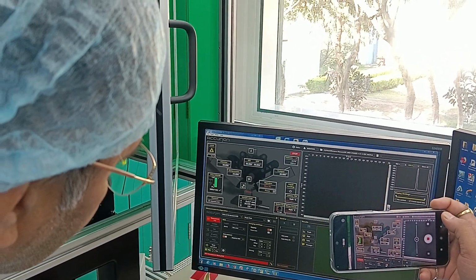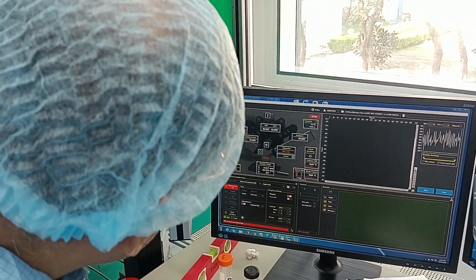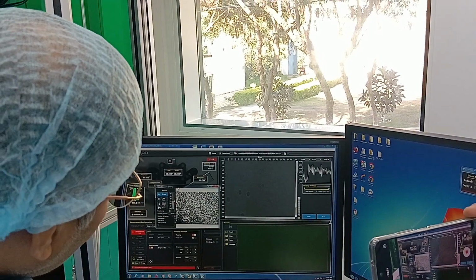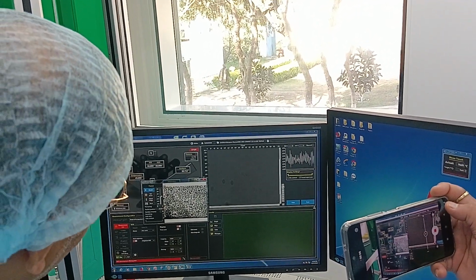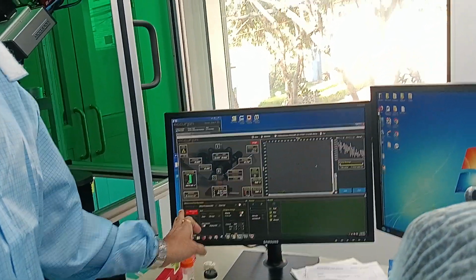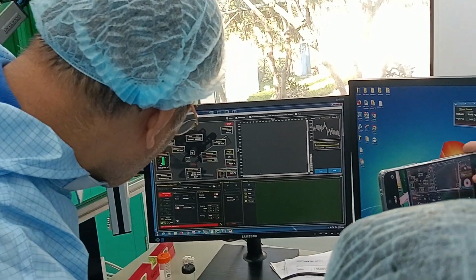Sorry. Okay, that is light, you can see that. If you want, I can show you. I can change the polarizer to see the light here. I can just say set focus and I'll get a light like this. Now you can see still it is red. This is red, I'll push it to the top. So you can see that everything is red.